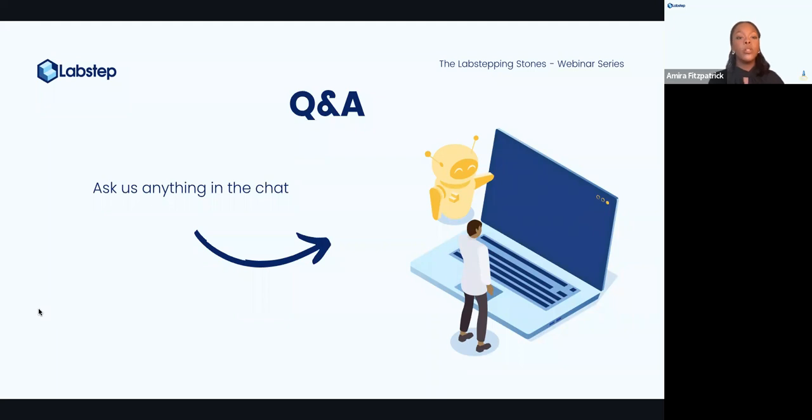Great. Maybe time for one or two more questions and then we'll move on to the rest of the slides. We've got a question here: can you connect and interface devices into Labstep? Yeah, absolutely. We have what's called a device client, so we can use that to capture data that comes from devices, and then you can pull that into your experiments. Like what we saw in one of those videos where I was dropping data into an upload field, rather than doing it that way, you can pull it straight in through devices, and then access that data in the same way that we went through in the video. Amazing. Ethan, I don't know if you want to pop a link in the chat from our help guide on how to install the device client, because that would probably be really helpful.